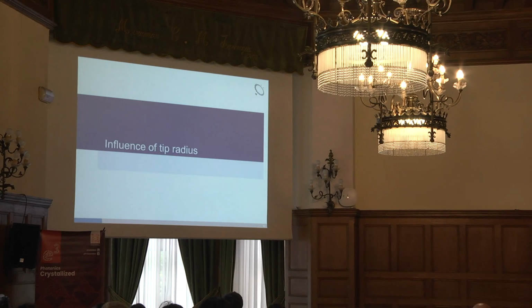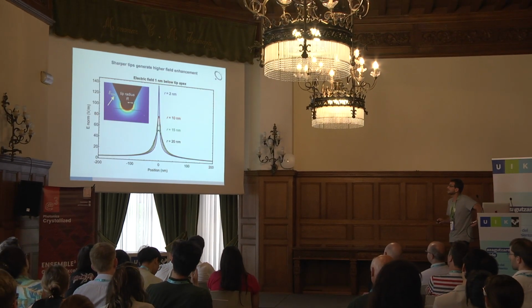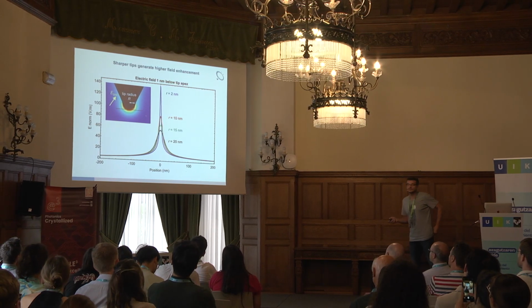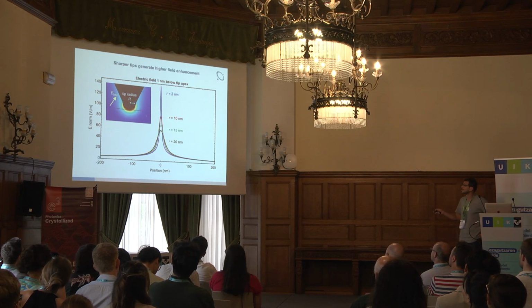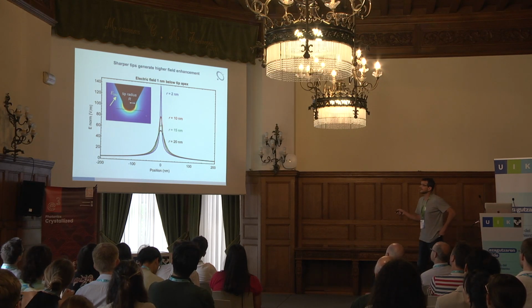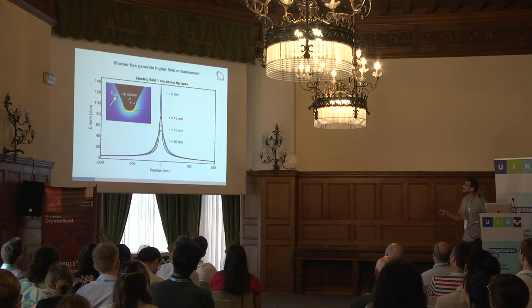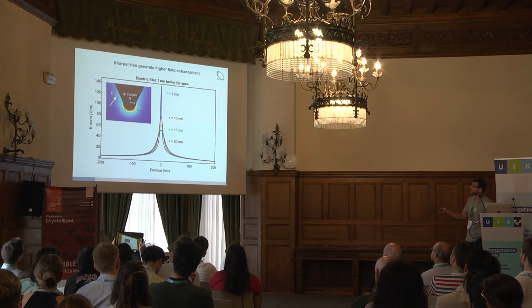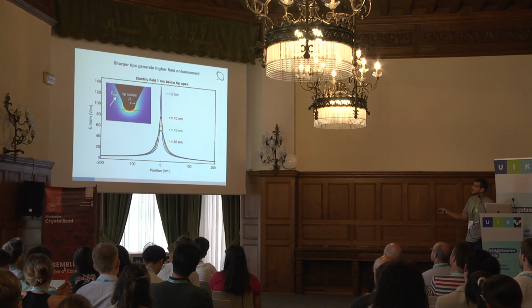Okay, now, influence of tip radius, so that we had already in this quiz. Now I show you here that's calculation. Actually, it was hard to find here some of this systematic calculation literature. This is from unpublished data from Stefan Mastel, who calculated this during his master thesis. So this is in infrared. I think this is a COMSOL calculation where we calculate here the field distribution along this tip for tips of different tip radii, right? 2 nanometer up to 20 nanometer.